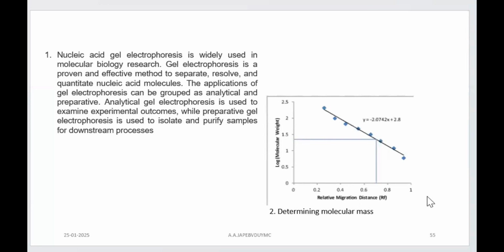You can have a standard sample mixture, say like myoglobin, glutamic dehydrogenase, aldolase, trypsin. You can take these. So if I say glutamic dehydrogenase, for example, you are going to have its molecular size around 5 into 10 raised to 4. Aldolase, it is around 4.2 into 10 raised to 4. Or you say trypsin, it is around 2.4 into 10 raised to 4. Myoglobin also is about 1.8 into 10 raised to 4. So known molecular sizes are there.